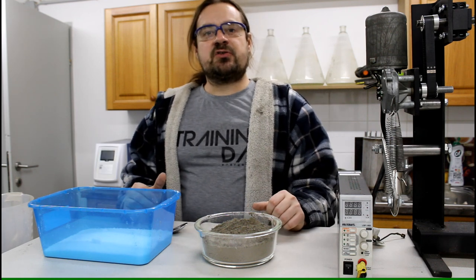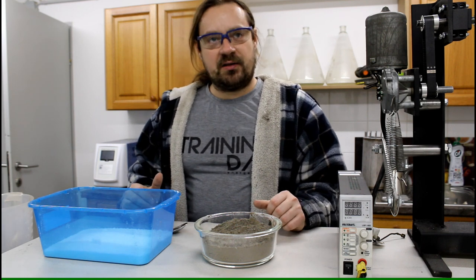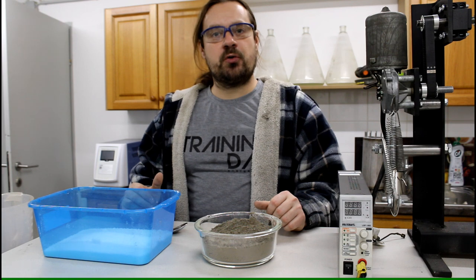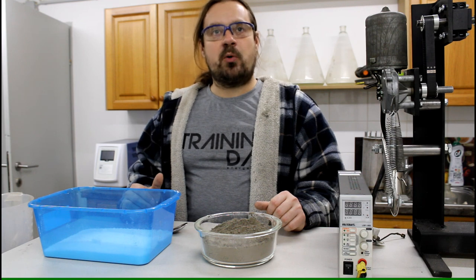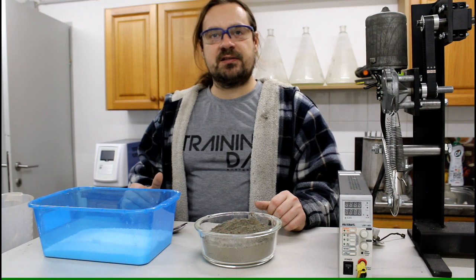The first method is called the lye boil method. The second method is called the lye fusion method, and the third method is called the sodium burn method. Today we are going to do the first one, the lye boil method. It's actually the safest one and the easiest one to do.